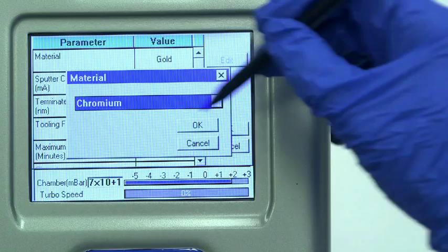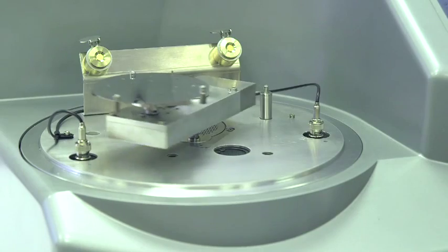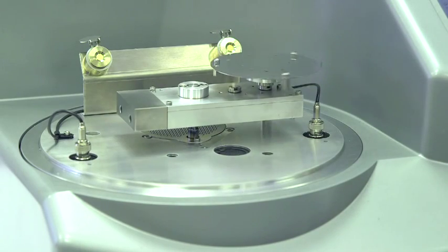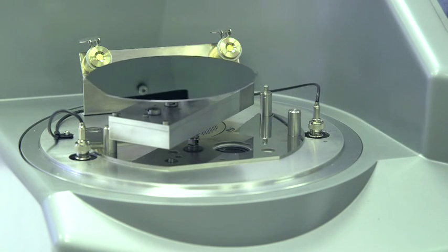The standard system can coat samples of up to 100mm in diameter, but with the use of an optional stage positioning assembly, substrates of up to 150mm can be uniformly coated from a single target.